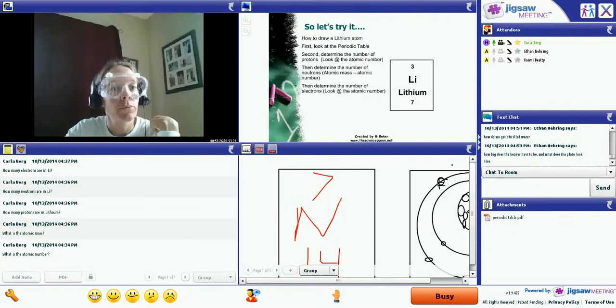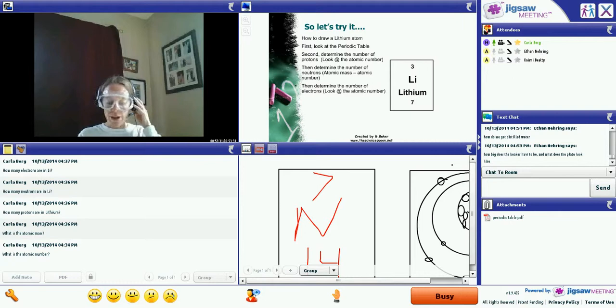Okay, I'm hoping that you guys were able to read some of the lab before coming today. Today we have two goals. The two goals for this lab are to observe the mole ratio in simple reactions and to observe excess reactants and limiting reactants. Basically, we are going to combine chemicals in simple ratios, 1 to 1, 1 to 2, and 1 to 3. There are 3 equations listed on page 26. Those are the ratios that we are going to use.